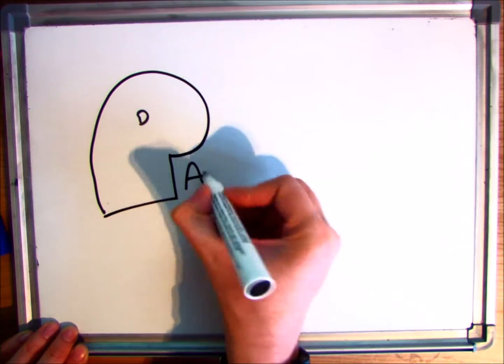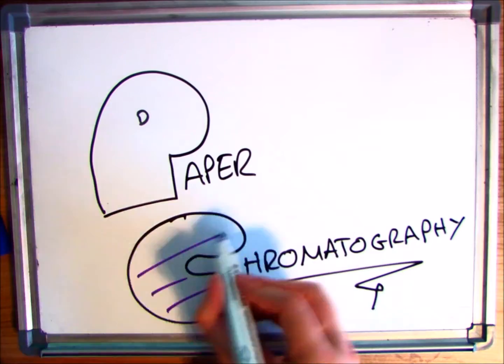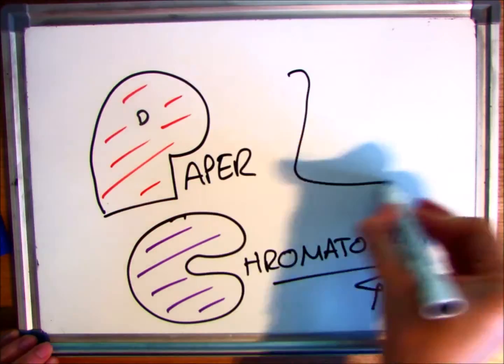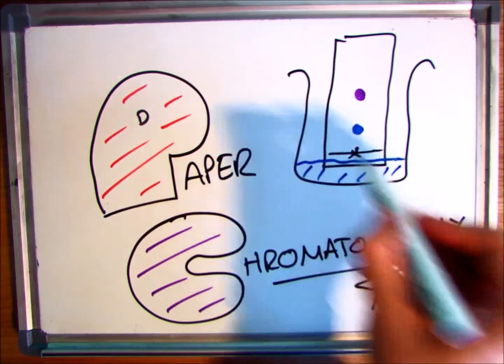This video is going to delve just a little bit more into the detail of paper chromatography. We're going to have a look at all the lingo and all the key words that are used in paper chromatography and how you can use that to explain how to set one up.